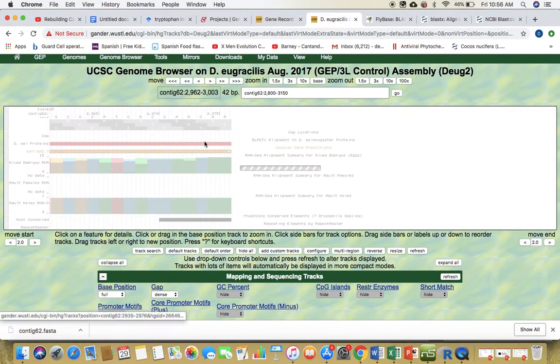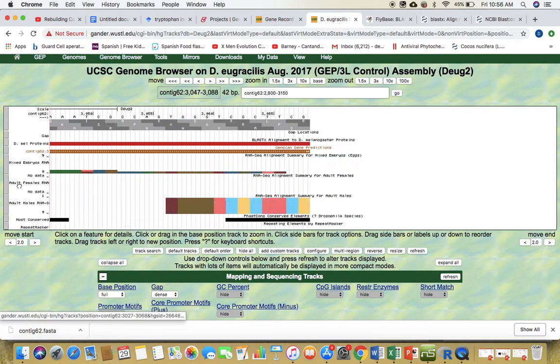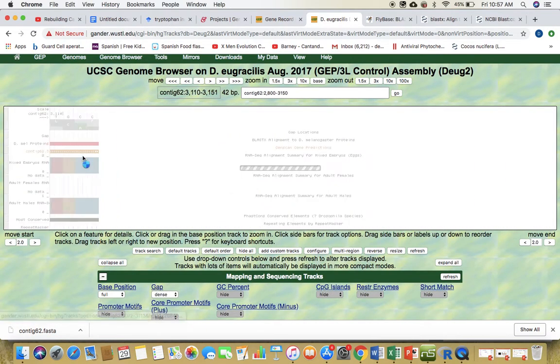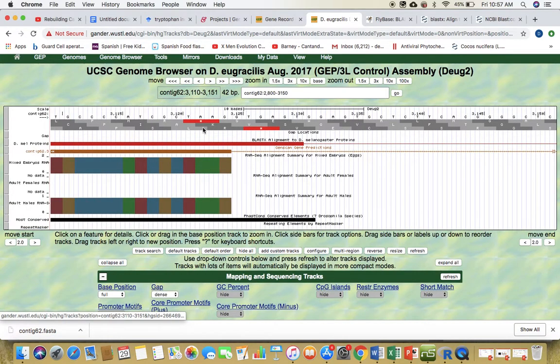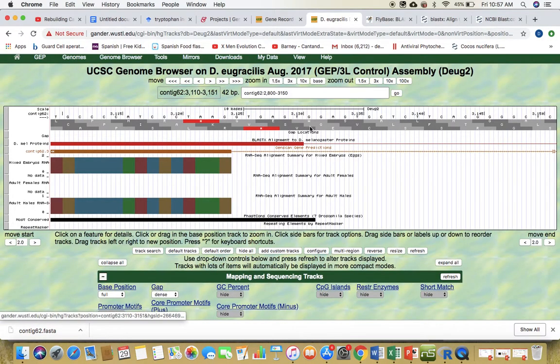Scrolling through it, still no stop codon. I'm going to scroll through the entire thing. It makes sense to look at every single possibility until I get to the end of my exon 2. Still in frame 2, at the end of my exon 2, I am going to find a GT site, because we had start, donor, acceptor, and now we need a donor site for here, that is GT.